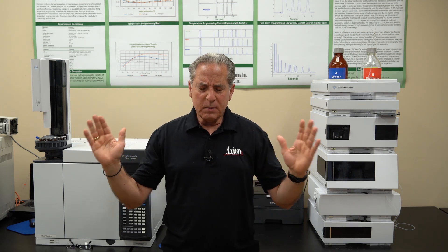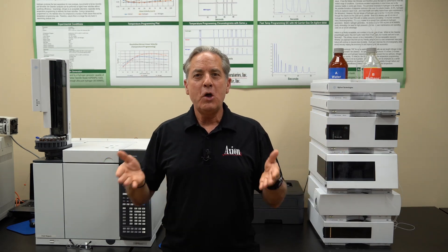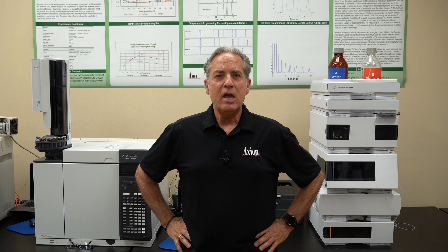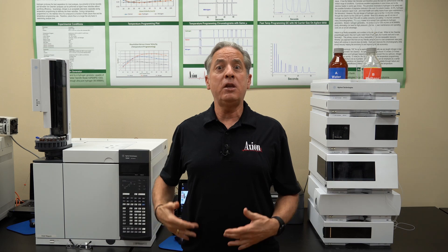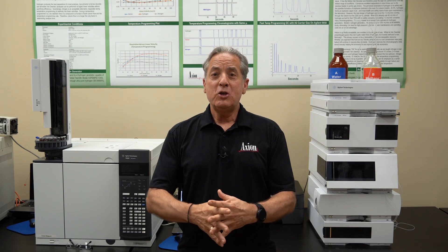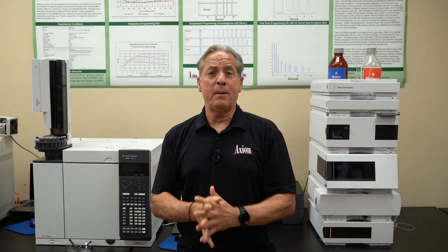Once we talk about method development and optimization, we can put the whole package together and show you how to apply this to real samples. One example: during the class, we're going to build a four-point calibration curve for caffeine, and you're going to measure caffeine in soft drinks. You, by yourself, will develop a beautiful linear calibration curve. Then you'll run a dozen different unknowns — coffees, teas, and soft drinks — and measure caffeine in real samples. All those skills you've developed will give you the confidence to apply them in your own lab when you get back home.